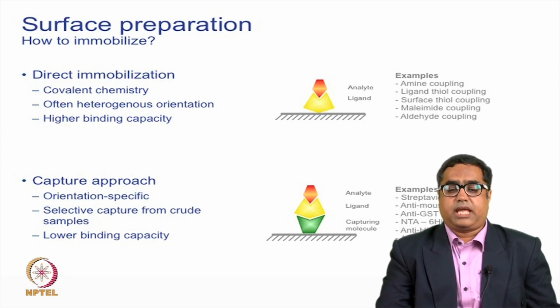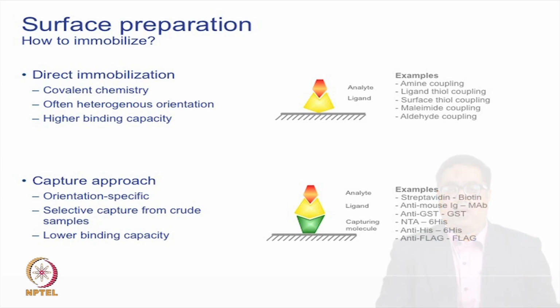Whereas when we look at the capture processes, because most of the molecules are expressed these days with tags, and when you have tags on the molecule, there are different chips which will capture the tags. Let us say we have a streptavidin chip that is available, and biotinylated molecules like proteins, peptides, DNA, RNA, all these molecules are captured by the streptavidin chip.